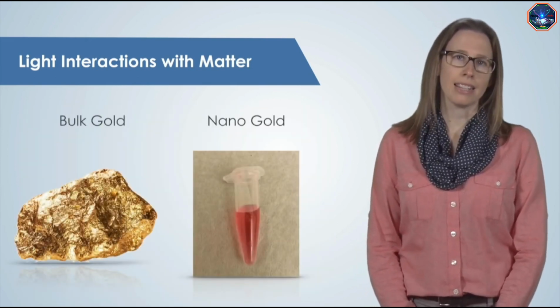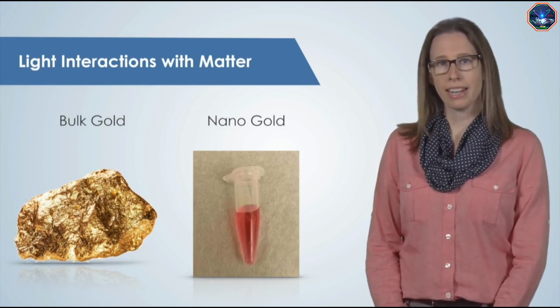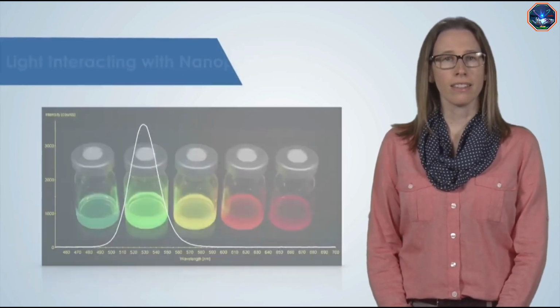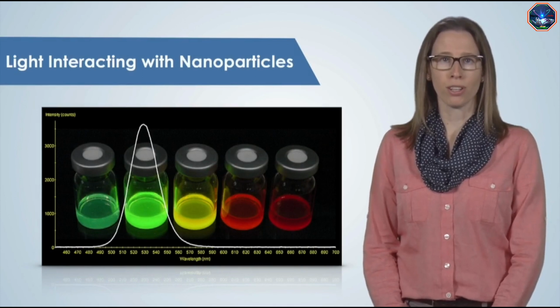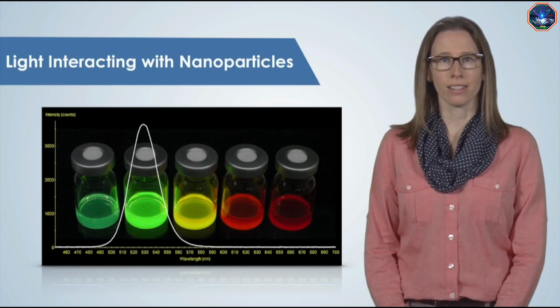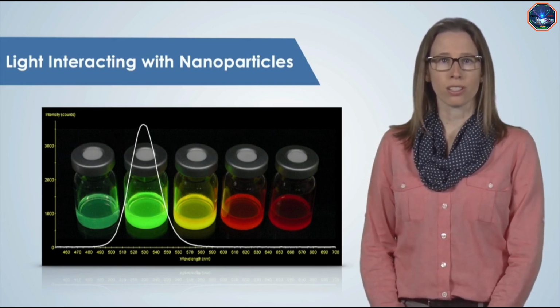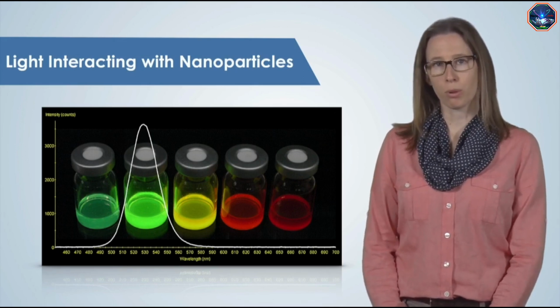But light interacts with nanoscale materials very differently. Bulk gold and nanoparticle gold look very different to our eyes. These vials all contain cadmium selenide nanoparticles. The only difference between the nanoparticles is their size. The nanoparticle size clearly affects the color of the solutions, and as the color of the solutions changes, so will the absorbance spectrum.